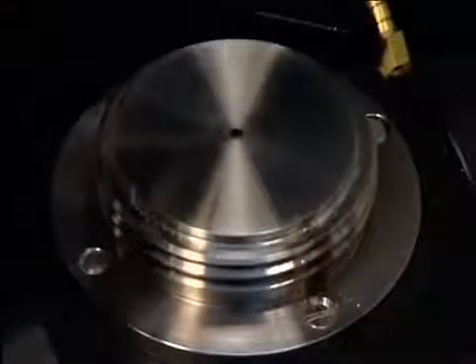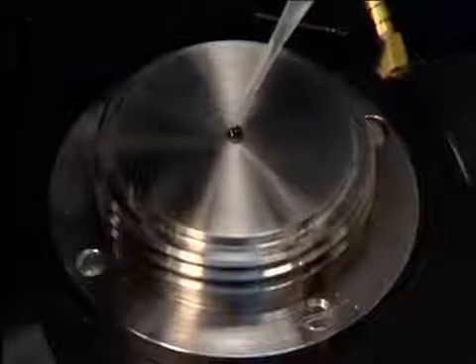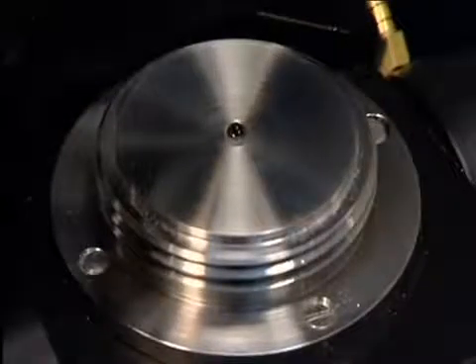For a liquid sample, the procedure is the same, but a few drops of liquid are placed in this type of sample holder. The cover is to prevent the evaporation of volatile liquid samples.